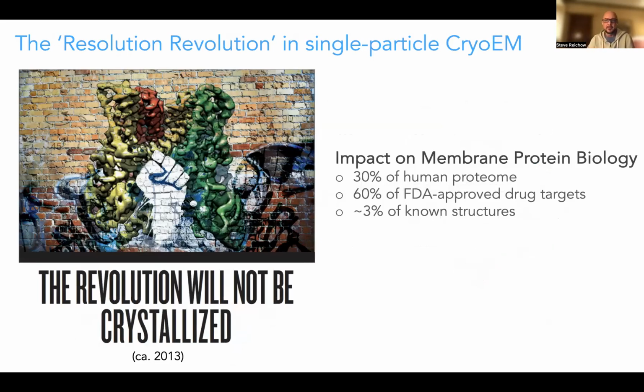This image that I'm showing here has really become the hallmark symbolizing this revolution in the field of single particle cryo-EM. But I want to remind us all that this is really a culmination of many different factors that coalesced around the same time. This had to do with improvements in microscope hardware, the new types of detectors that were coming out, as well as improvements in software algorithms to determine the structures of these proteins with high accuracy.